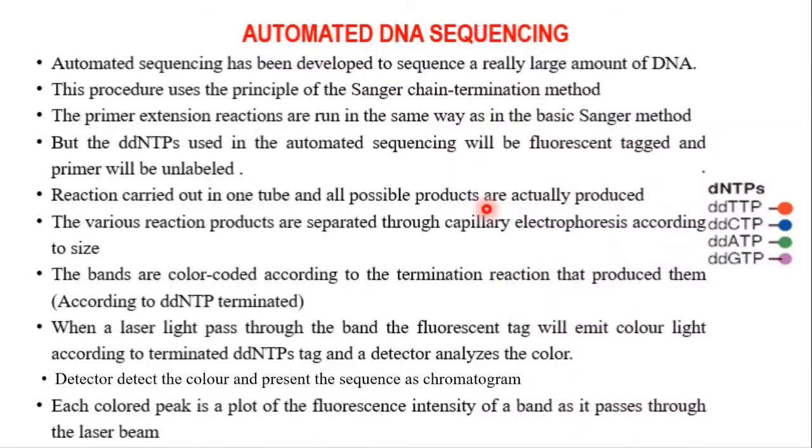After the reaction, the products undergo separation through capillary electrophoresis, where we separate according to size, as done in Sanger's method or any electrophoresis.